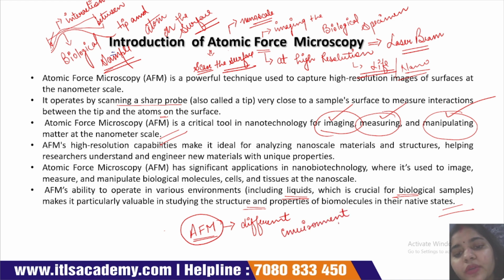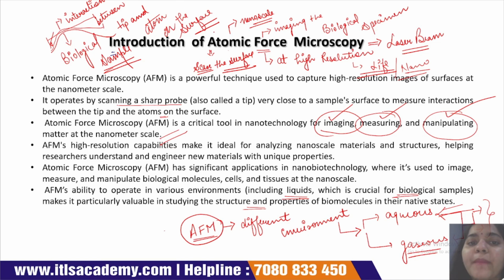If we want to study the structural and biological properties of a biological sample in an aqueous environment or in a gaseous environment, in both environments we can easily visualize and study the different properties of the biological sample with the help of this atomic force microscopy.